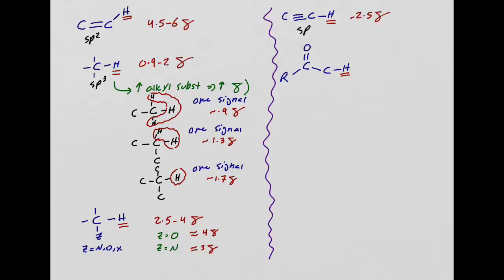Again, this is kind of the same idea because oxygen is electronegative. So there's a pull of electrons going this way, right? Because this carbon is not directly attached to an oxygen like it was here, the chemical shift is going to be a little bit lower. Because here, when the carbon was directly attached to oxygen, a lot of these electrons are being pulled this way, so that makes this one really electron cloud deficient, and then you would have a high chemical shift.